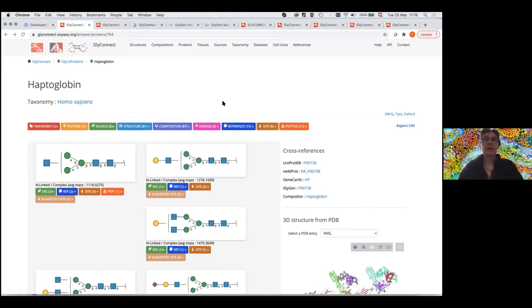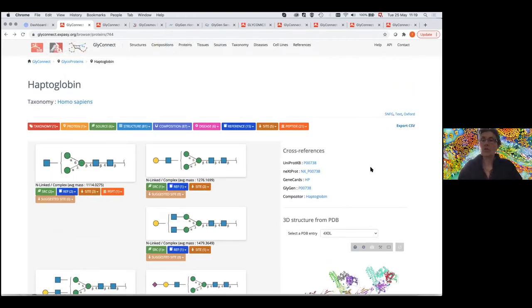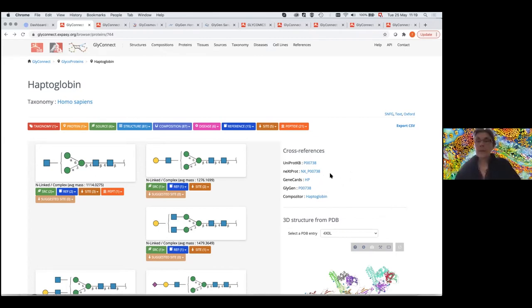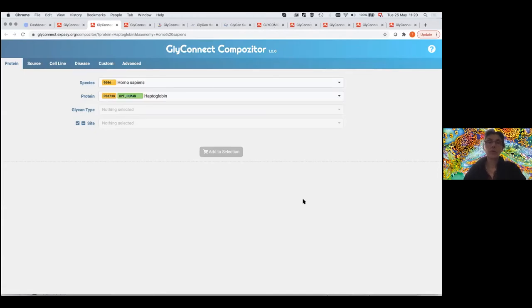Any of the data can be exported in CSV — all the information that is in that page regarding taxonomy, the protein, etc. You can also copy the composition to the clipboard by clicking — so if you want exactly the glycome for haptoglobin, you copy it and it's done. That can be very useful; we're really trying to help the building of composition files. We have cross-references with UniProt, Neqprot when it's a human protein, GlyGen — GlyGen points to us, but we also point to GlyGen — and GeneCards for human genes. We also always have the link to Compositor.